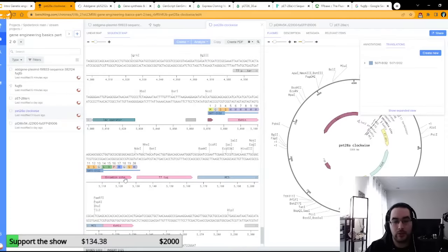But like I say, I don't like thrombin. We're going to leave it alone because I don't feel like changing this right now. But because we're leaving the thrombin site here, it means we also need the restriction site that's right next to it. That way, if we want, we could be inserting a new protein between these two restriction sites, right? So when we tell the printing company where to put our piece of DNA that they just printed, we're going to tell them NdeI and HindIII.